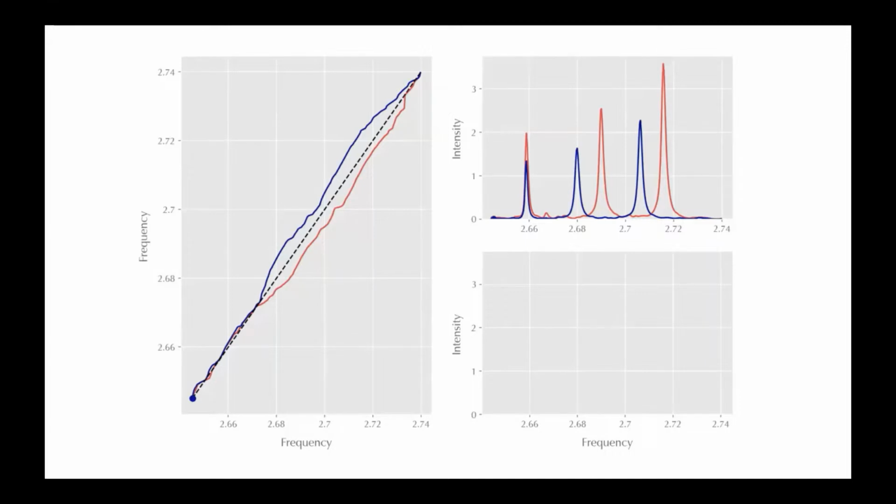So how it works is, the further away a warping function is from that diagonal, the more it will move its corresponding spectrum along the x-axis. Furthermore, if the warping function lies above that diagonal, that means the spectrum is going to shift to the right. Whereas if it lies below, like with the red warping function, that means the red spectrum is going to shift to the left. Now I'm going to show a video which shows some dots being traced over the warping functions and the spectrum. And as that happens, it's going to trace out the registered functions below.